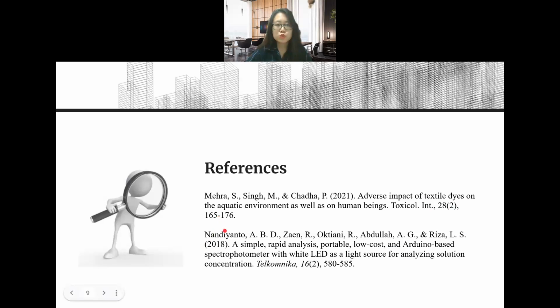These are the two main references of my study. The first is about the dye pollution from the textile industry, and the second one is about the development of an Arduino-based photometer.